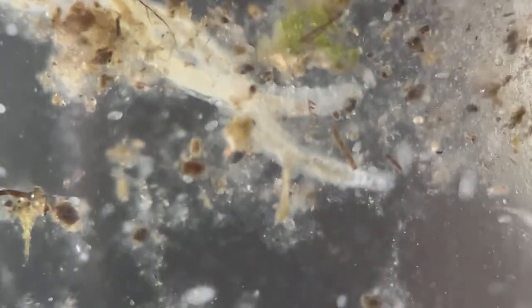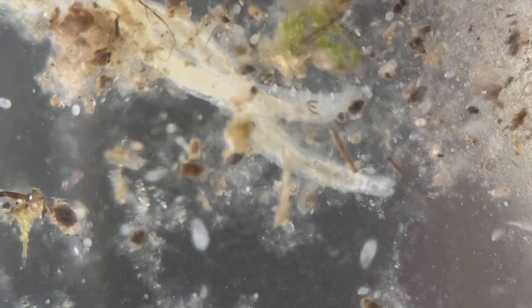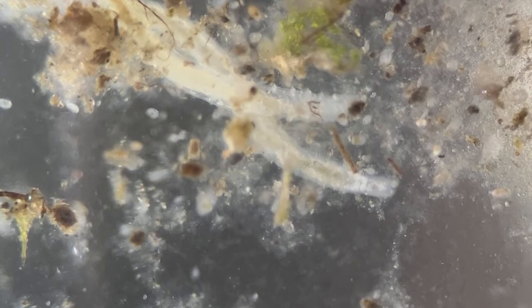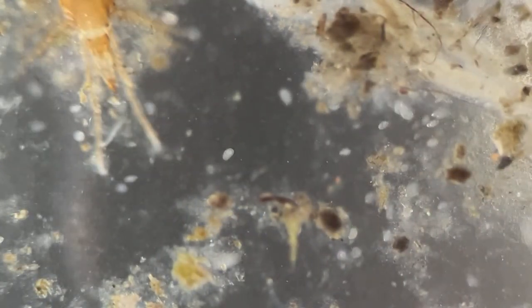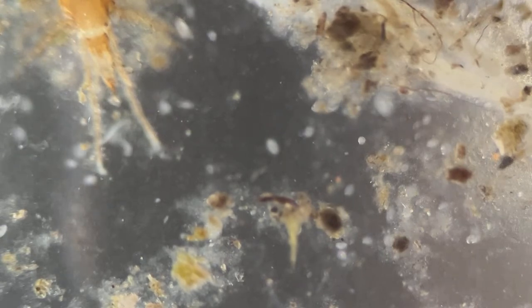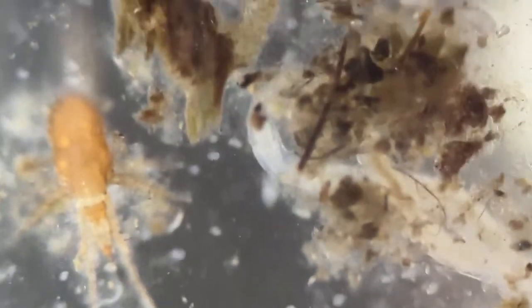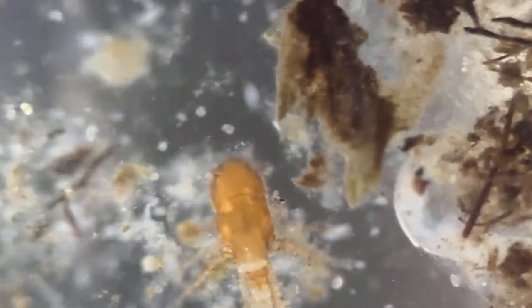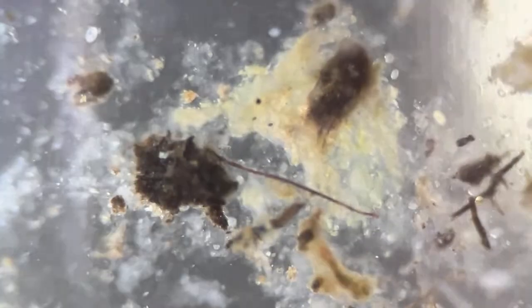This worm around, this is more clear, better to observe. The color pattern is much better defined.